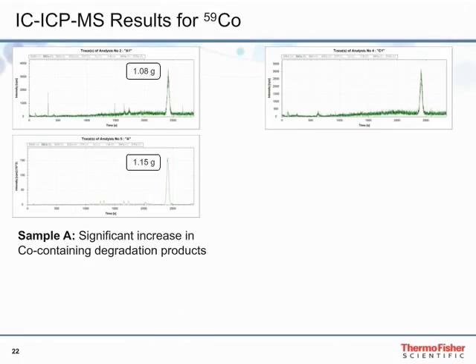When sample C was analyzed, the control anode produced a chromatogram nearly identical to that for sample A. However, the cycled anodes already showed signs of surface corrosion in the form of a white coating. For that reason, it was decided that the corroded and non-corroded parts of the battery would be analyzed separately. Results in the chromatogram on the lower right indicate that the white-coated corroded part contained high levels of degradation products when compared to the results for the non-corroded part of the battery.